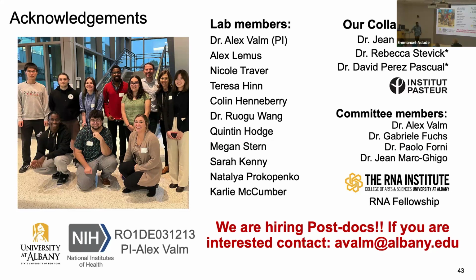Follow-up question, if I may. The machine learning model approach is fascinating. When we do machine learning models on microbiomes to map microbiomes to traits, it's multi-dimensional, with many features going into that mapping. And one of the things you can do is extract feature importance from those features, to determine what's most important in the analysis. Is that something that can be applied to the kind of microscopy machine learning models you're building, to inform us about what are the features that matter most in terms of building accurate imaging? That seems like a lesson we can all learn from. Maybe at some point, the group could put something out about what is most valuable when we're thinking about microscopy and microbial communities.